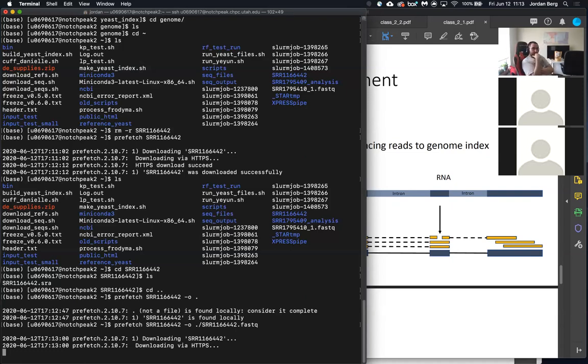Yeah, so once you have the FASTQ file, you can delete the SRA file. Yeah, because I think they are 2 GB, 3 GB each or something, and they are taking space. So yeah, that's fine. The only reason you need the SRA file is to generate the FASTQ file afterwards. Okay, so I can just remove them. And then I uploaded a Word document in the chat box. So maybe that will explain what I was saying, and also what errors I was getting. Okay.